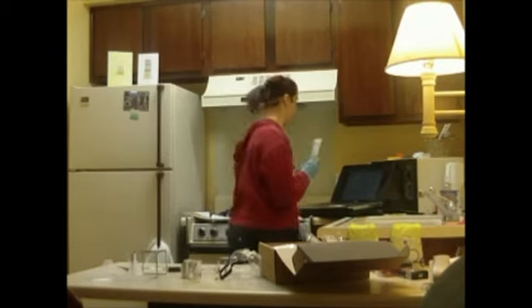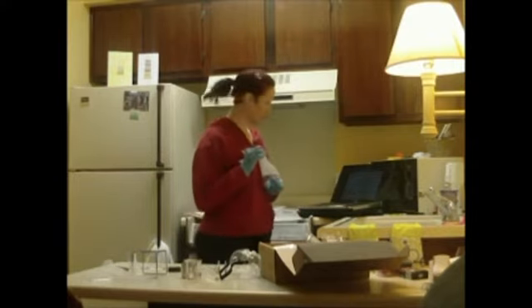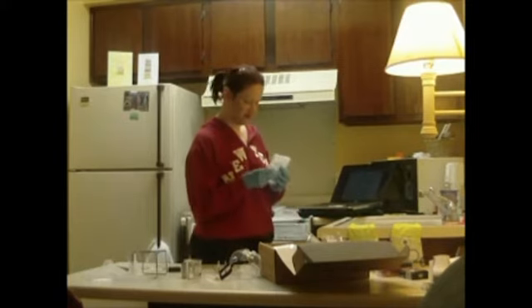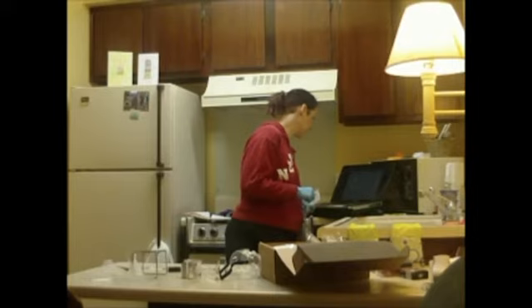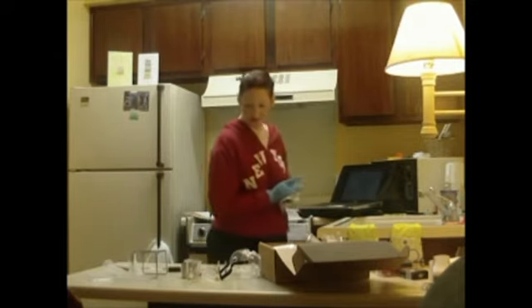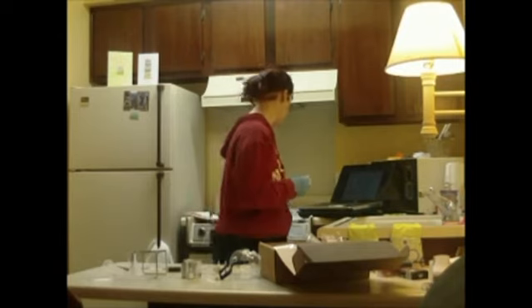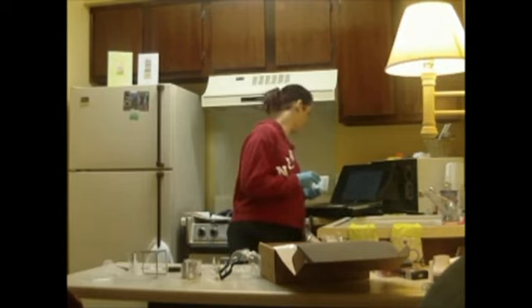Thus, start opening bags. Pipette, empty short stem label. There's one, I think. Okay, I'm supposed to have a 2-pipette empty short stem label. Hydrochloric acid, I guess, or hydrogen chloride, and sodium hydroxide? There's supposed to be pipettes like this, but this is not quite a great sign. Let's see here. Sodium chloride in vial full. Yes, we have. Sodium hydroxide, 4 milliliters in a dropper bottle.